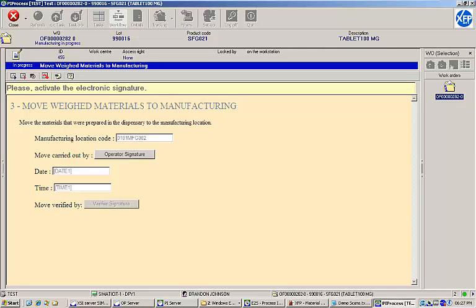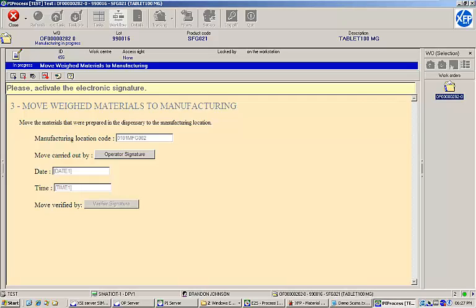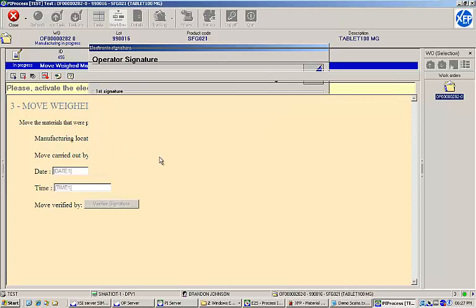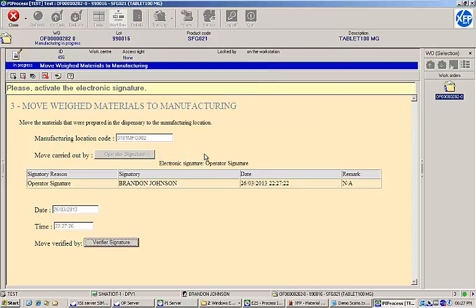Next, we are prompted to move the weighed materials to the manufacturing location. This task simply provides some basic process instructions and requires an operator and verifier to provide electronic signatures to certify that the tasks have been completed. You can see the details of my signature above. I'll provide the credentials of a second user to continue.